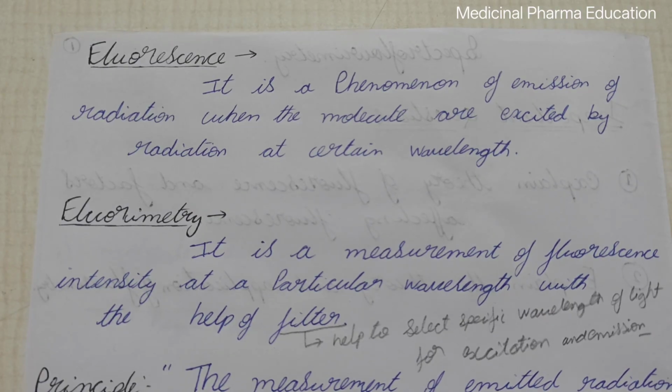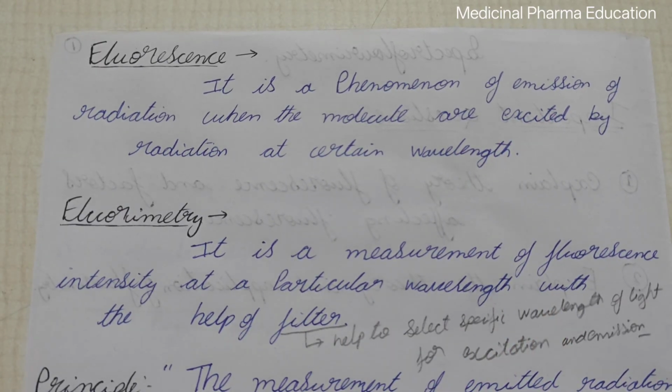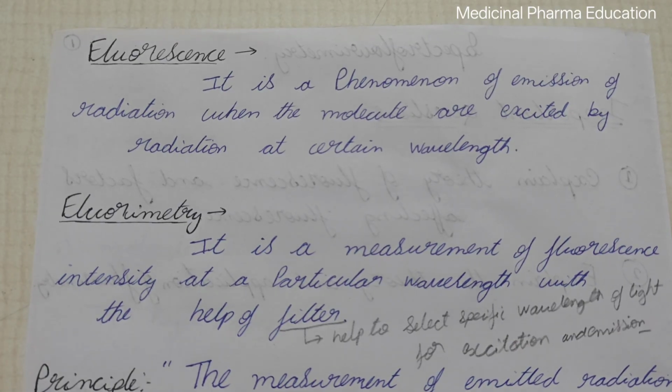As the excited state is unstable, it emits the absorbed light back, and based upon the emission of the particular sample, we detect what elements are present in the sample.